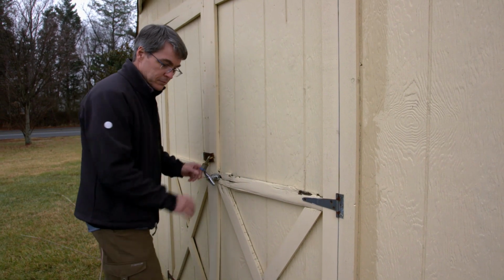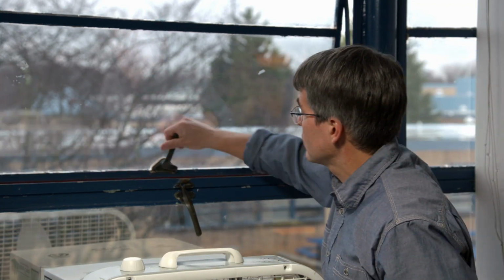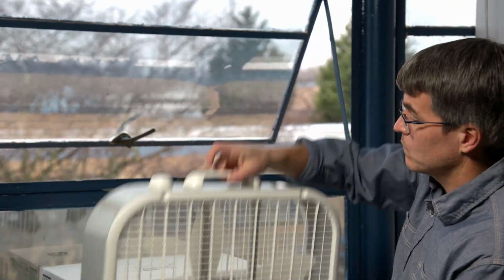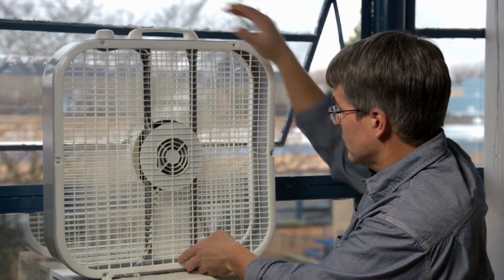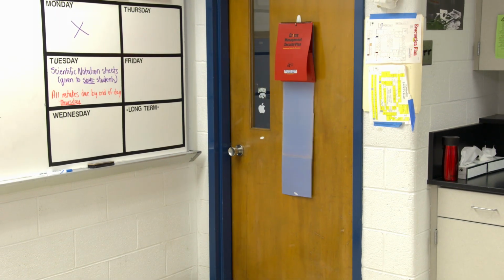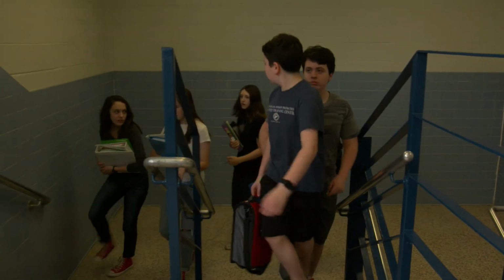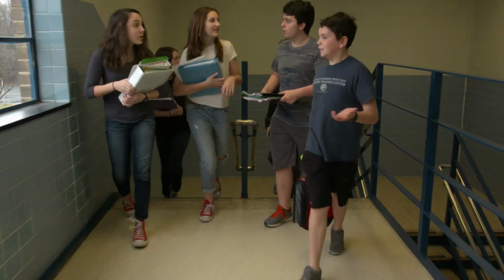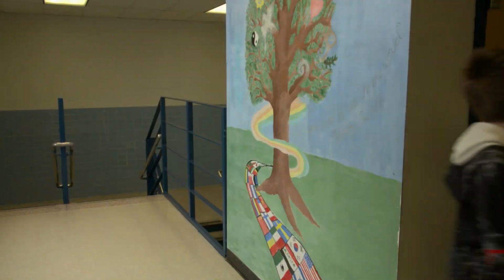Now that you have cleaned up the spill, take these additional steps. Ventilate the room where the spill occurred by opening windows and using fans to blow air in the room to the outside. Ventilate the room for at least 24 hours after the spill occurred. Keep the cleanup area isolated from the rest of the school. Make sure doors and ventilation vents are closed. Keep students and school staff out of the cleanup area. Consider hiring a professional to check the mercury levels in the air in the school. Finally, you will need to properly dispose the bags of mercury-contaminated materials you gather during cleanup.